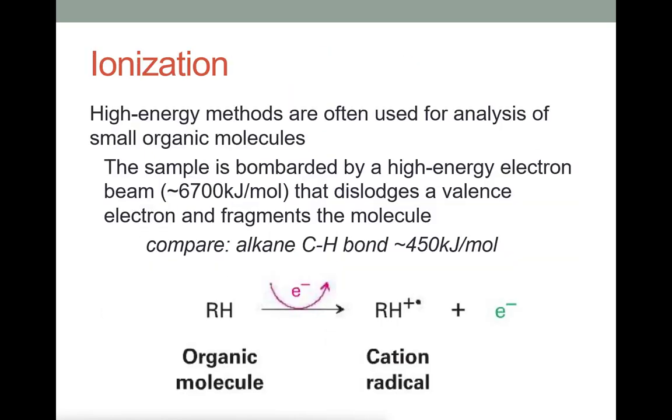I should go back here just to say that the reason we would use a different kind of ionization for a larger molecule is that we don't necessarily want to fragment a large polypeptide, for instance, a protein, if we're doing some sort of a biochemical analysis, because there would be so many pieces. Proteins are such large molecules that we would end up with just a lot to wade through. So typically we use a lower energy ionization source for large molecules so that we can try to keep more of the pieces intact, have larger fragments to deal with.